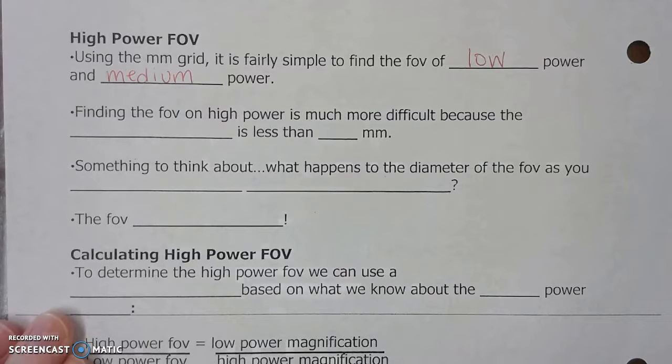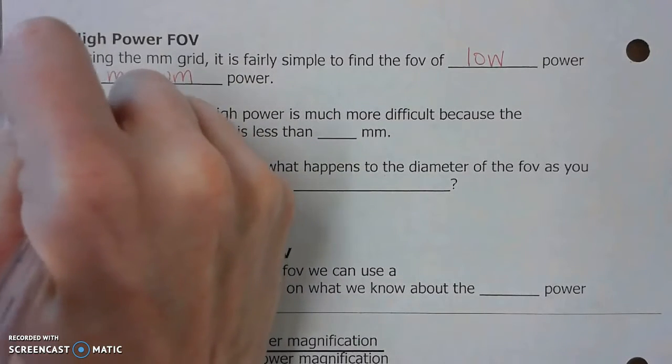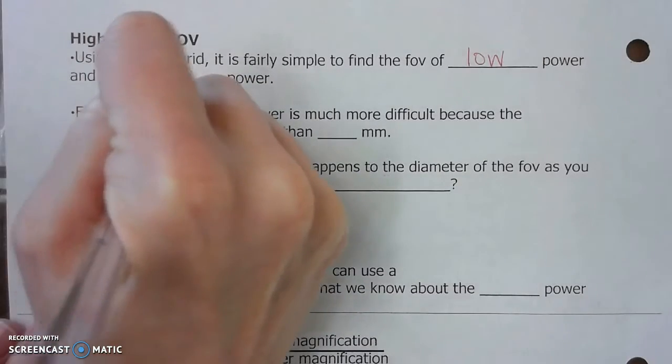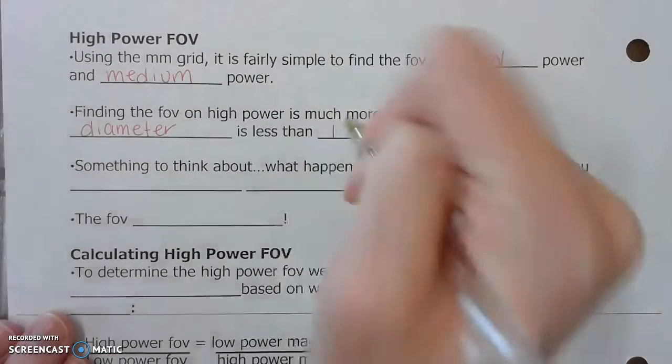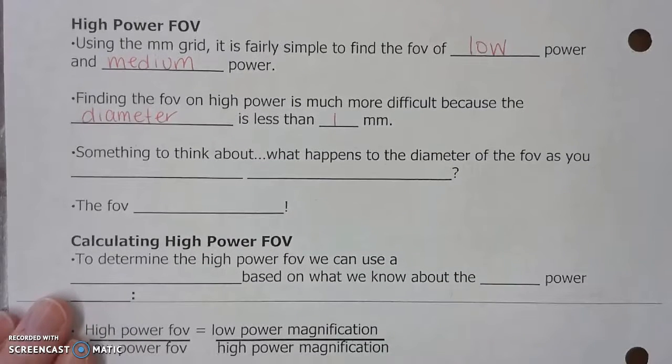Finding the field of view on high power is much more difficult because the diameter is less than 1 millimeter. Each box on the grid we use is 1 millimeter in diameter. However, the high power field of view is less than 1 millimeter, so the grid is not useful at all.